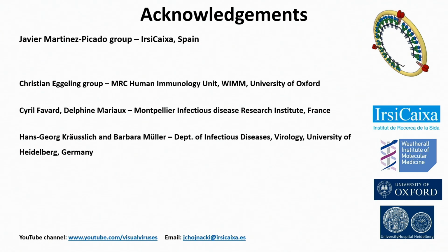The number of ENV molecules would make a difference only if you start getting a whole lot of molecules, which would make it more difficult to distinguish individual clusters. But of course, the system that we have utilized here, I think will quite nicely show that it recapitulates what was shown by electron microscopy. So we actually didn't test a situation where we loaded the virus with a lot more envelopes. This was something that we honestly didn't do. We were happy that we had a system that has been shown to be consistent with the data from electron microscopy. So it looks pretty cool.